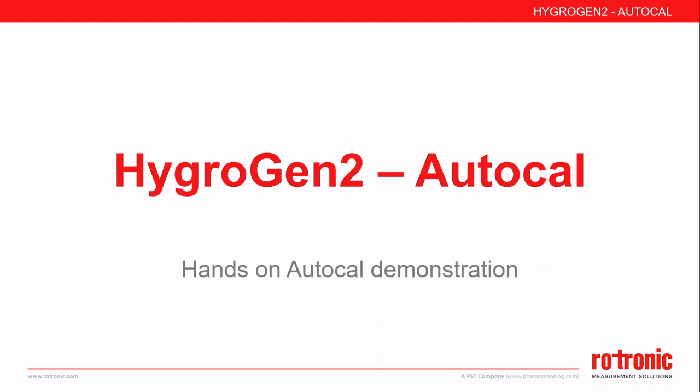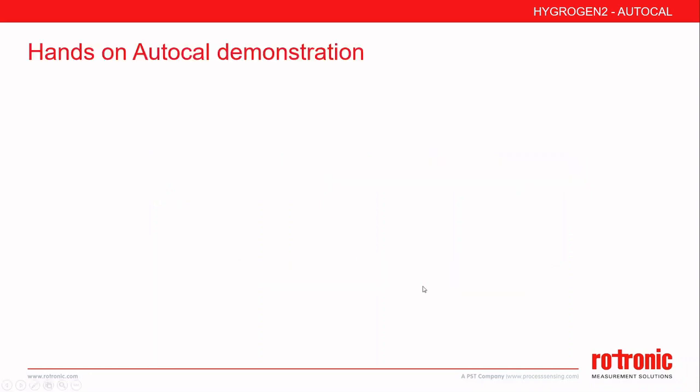Welcome to this HygroGen2 Autocal hands-on demonstration video. In the following slides, we will take a brief look at some of the Autocal functions and features and provide some best practice guidance. We will introduce Autocal and its basic functions.